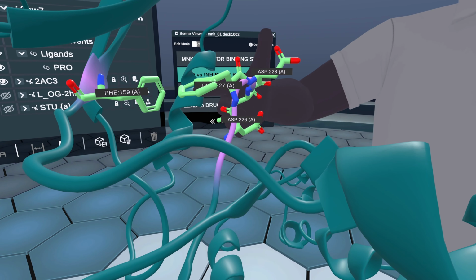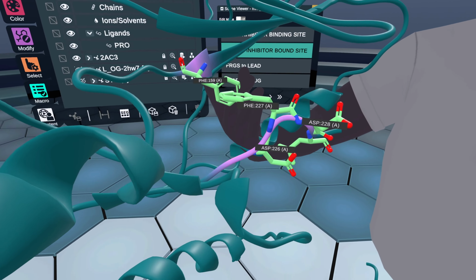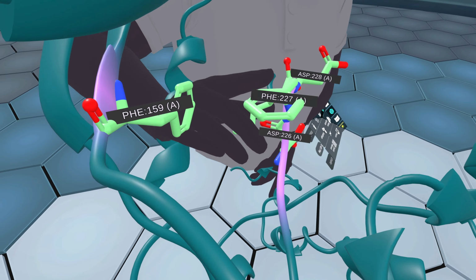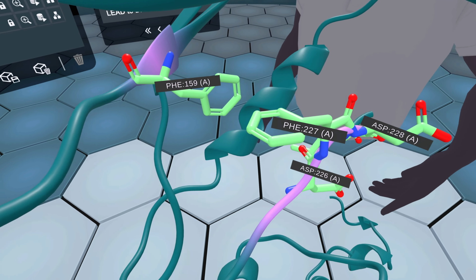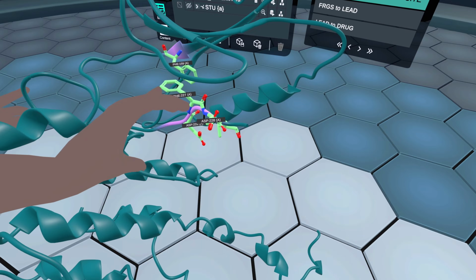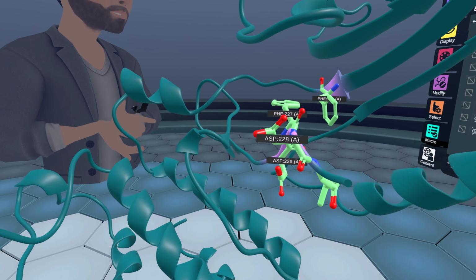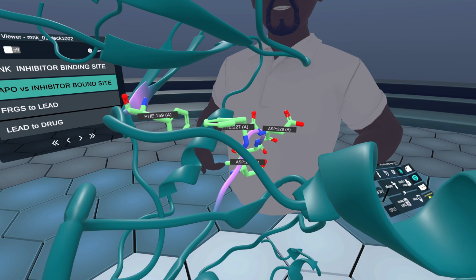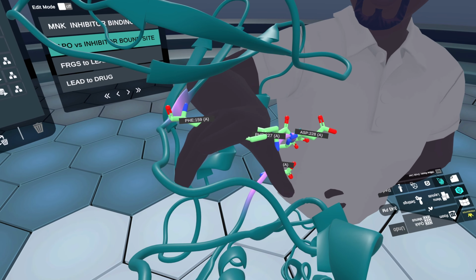So it almost auto-inhibits. As you can see here, what it's doing is actually forming an edge-face interaction between phenylalanine 159 and 227. So that's kind of mimicking what the Staurosporine was doing earlier. Obviously, this edge-face pi-pi interaction. This is very interesting because if you had this structure alone, without the Staurosporine bound structure, there's very little you'll be able to do to develop inhibitors.